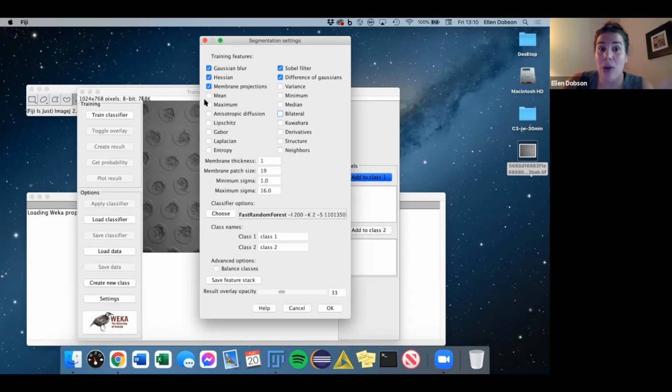And then too, you might say, okay, which feature do I use? How will I know if default maybe isn't working? In this case, it didn't really work for this particular image. If you go back and look at that forum post, the person who suggested that they try this tool actually knew what features would be good to use in this particular case. And all of these things are documented as well. So you can read what the maths are that go behind these feature calculations in your particular situation.